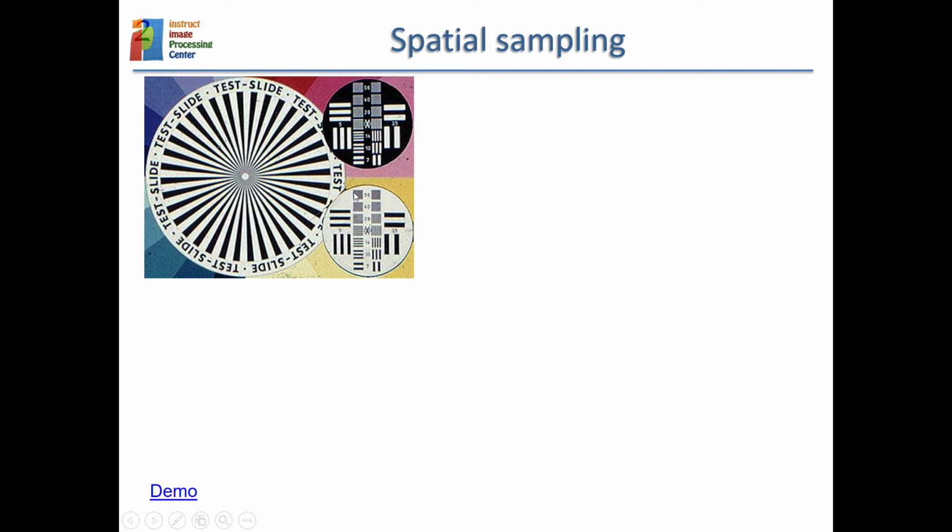What we see is that when we travel around this circle, for instance, we go from black to white and then black and white. There will be a number of pixels that are white, and then approximately the same number of pixels that are black, and then the same number of pixels that are white. So this is a kind of wave. This wave goes up and down like typical waves do.